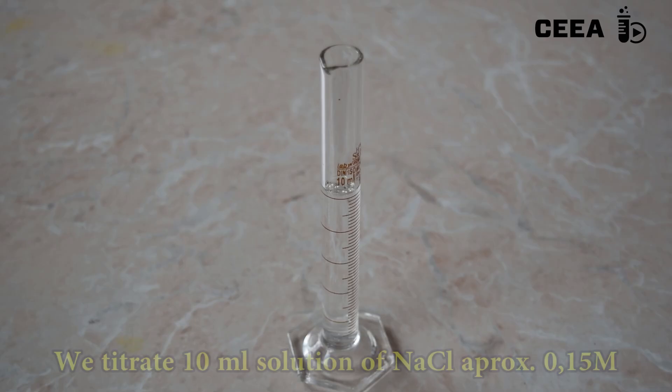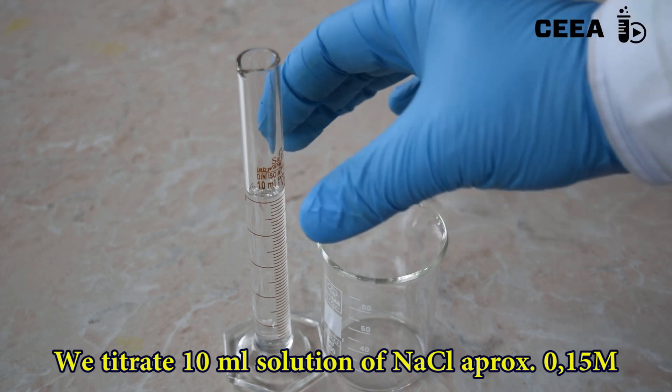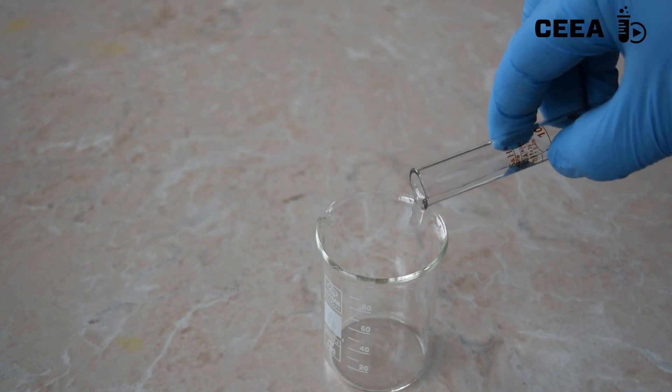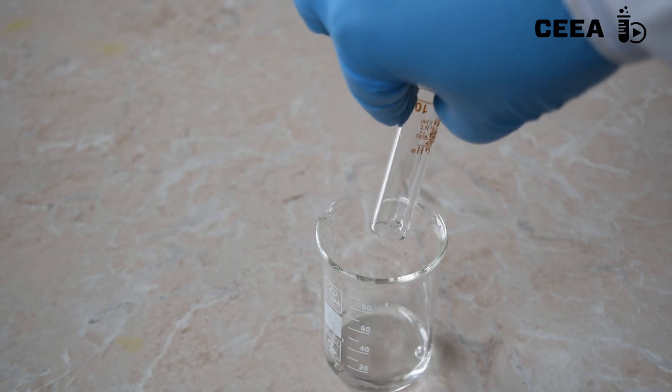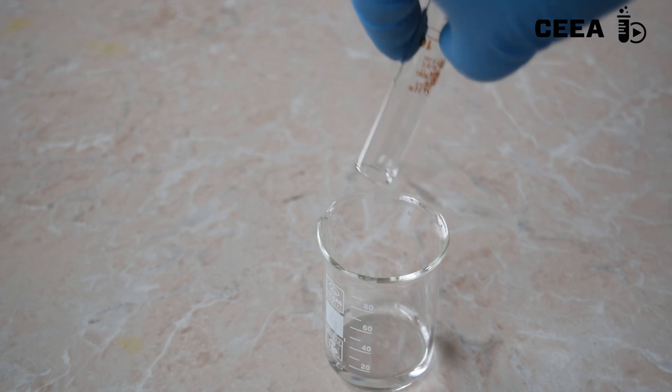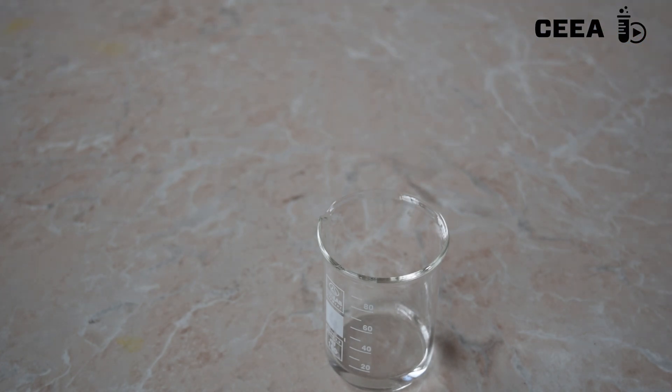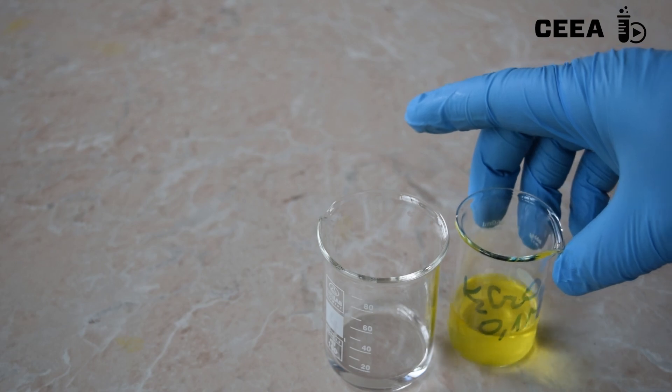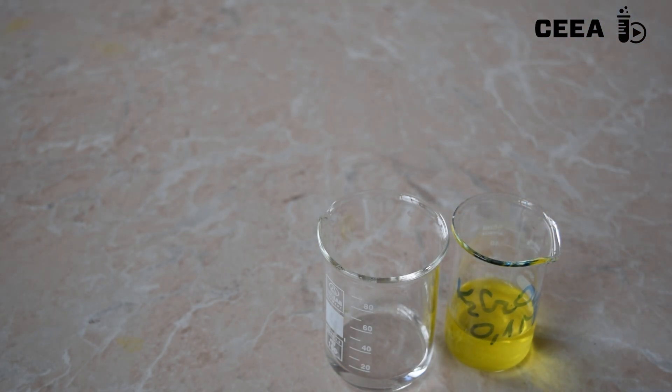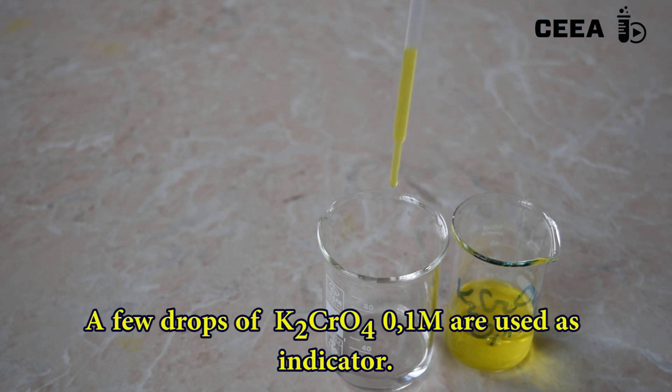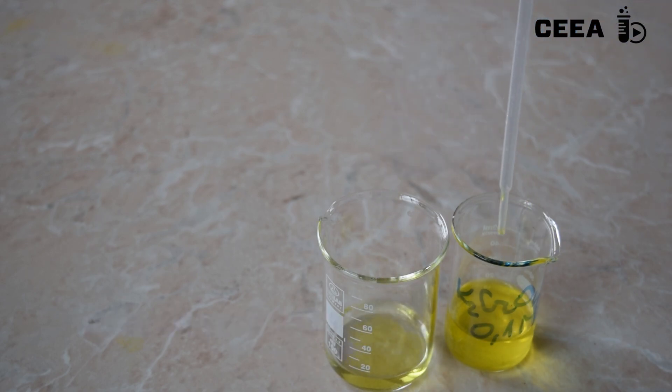To perform the titration we place 10 ml of 0.15 molar sodium chloride in a beaker. We add a few drops of 0.1 molar solution of potassium chromate as indicator.